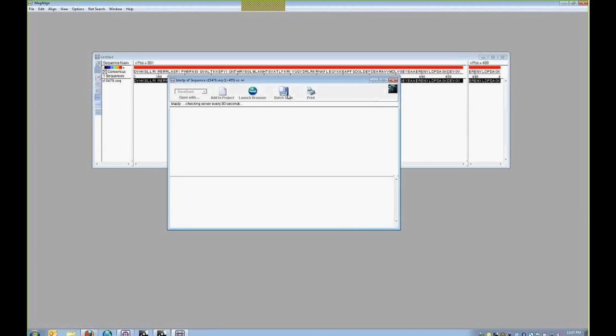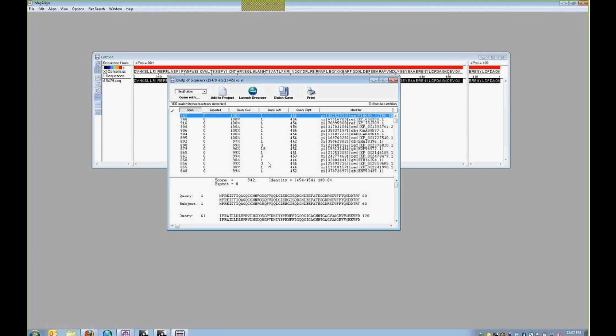And then finally, I can batch save my results so that I can use them at a later time. Now, I do apologize for the delay in returning the results. With the webinar running, sometimes the connection to NCBI slows down a little bit. So once we have our results back, we can go ahead.